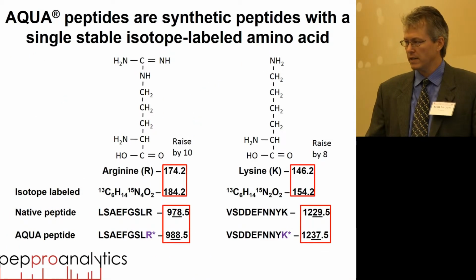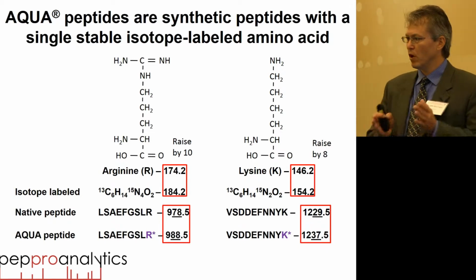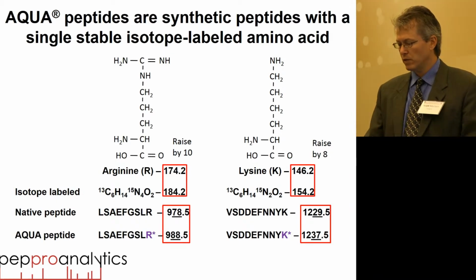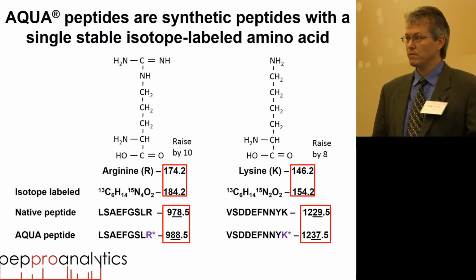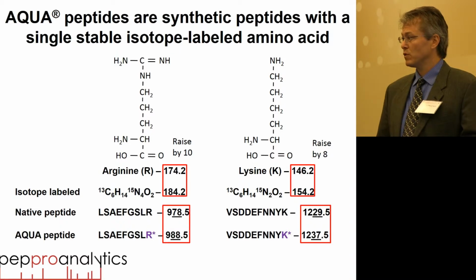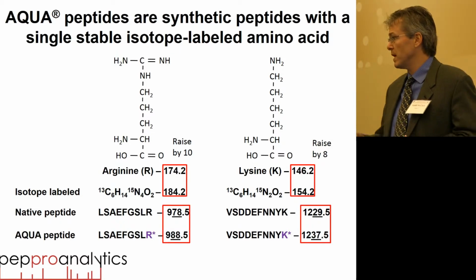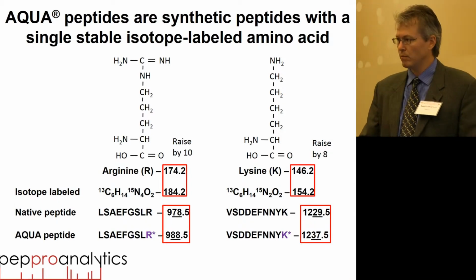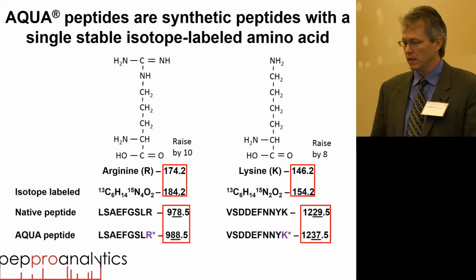This is happening all very quickly, so there's a lot of setup and setting up their databases, your sequence databases, so that you always know with a particular run what you're looking for. You can measure greater than 10 different peptides every second. So the multiplex feature here is pretty incredible. You saw two-dimensional gels, which obviously will separate proteins on a pretty broad scale, and so you can get, what, hundreds, Crystal? Easily hundreds of dots. And so this even expands upon that and thinking about proteomics generally. But again, what we're talking about here is targeted.